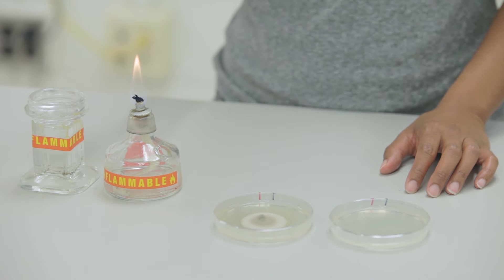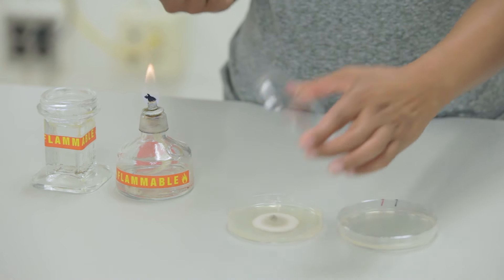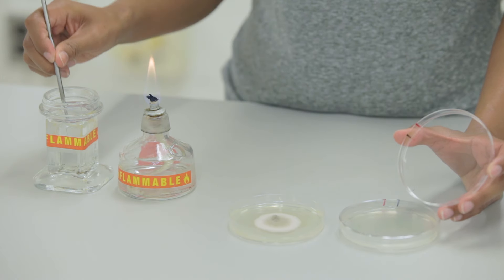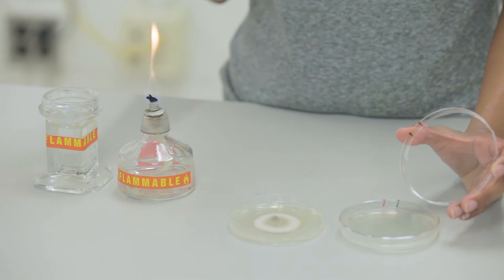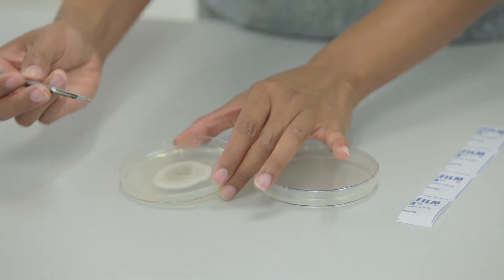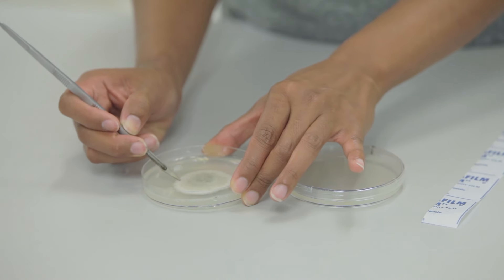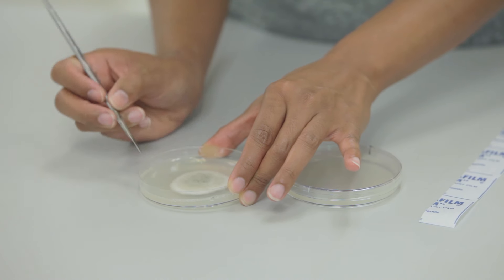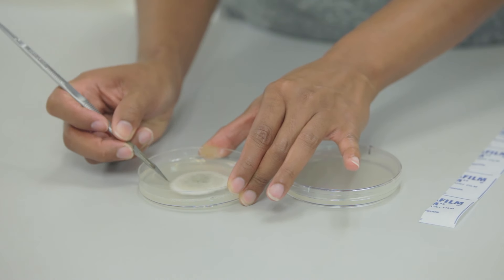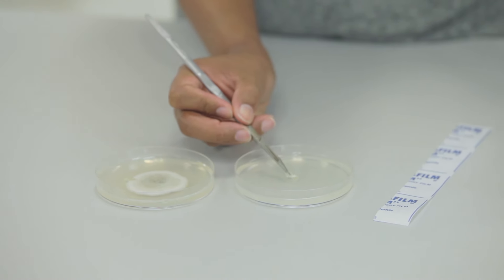For this next step, we will need a sterile scalpel and a fresh plate of growth medium. Sterilize the scalpel as before. We'll need to isolate from the edge of the colony since that is the area where the pathogen is most actively growing and where the least amount of contamination is likely to be. With the scalpel, make a cut at the edge of the colony and remove a piece that includes both the colony and clean agar, then transfer that plug over to a new plate.